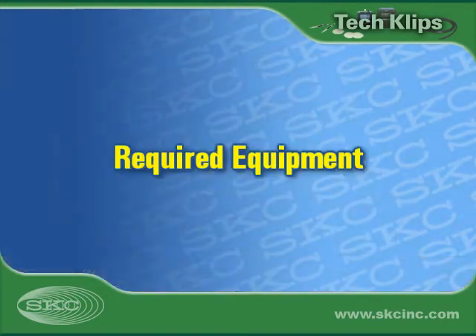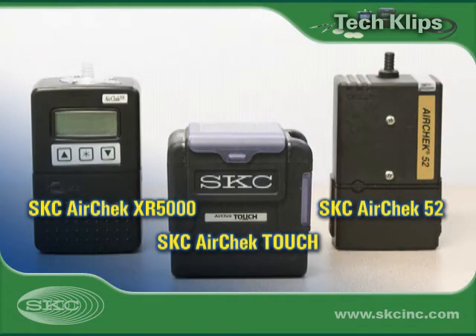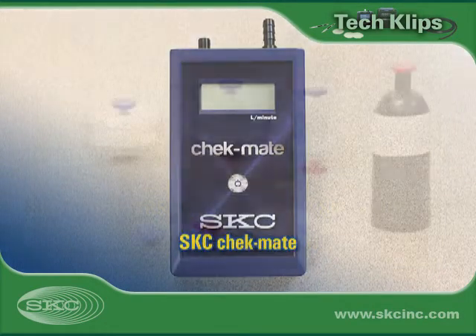Start by assembling the equipment required for calibration and sampling. Choose a constant flow air sample pump capable of flows of 1 liter a minute or higher. Select a calibrator within the pump's flow range.